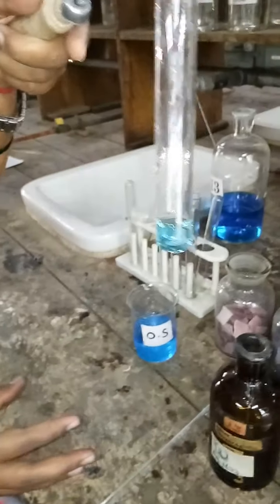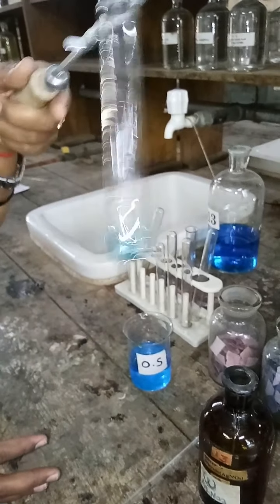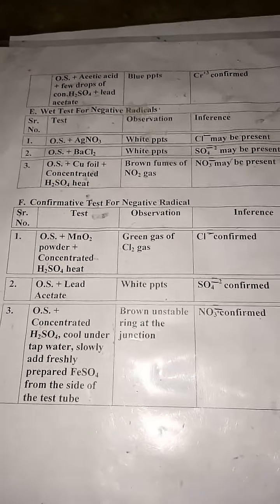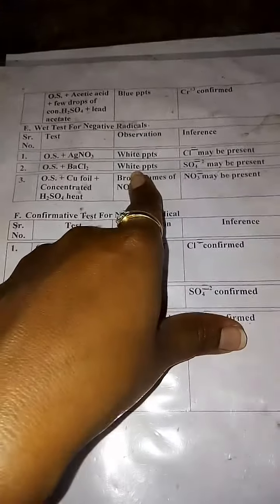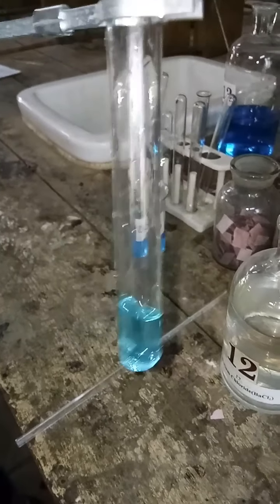Our next test is OS plus K₄Fe(CN)₆ (potassium ferrocyanide). If you get brown precipitates, it means Cu²⁺ is confirmed. I will take a small amount of OS into a test tube and add K₄Fe(CN)₆. As you observe, you get brown precipitates, which means Cu²⁺ is confirmed. So my positive radical is Cu²⁺.